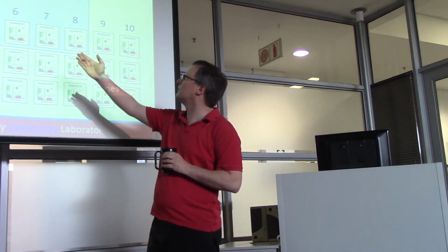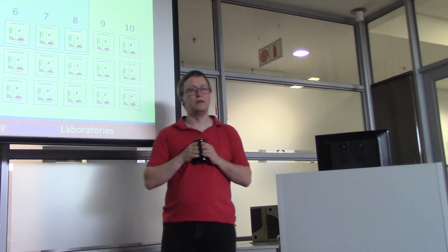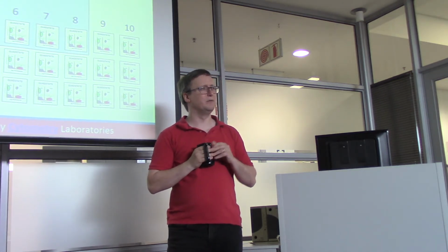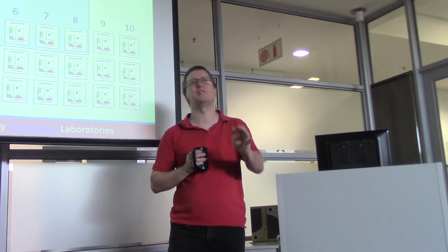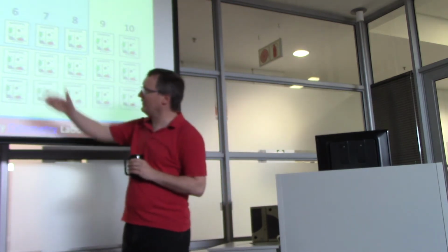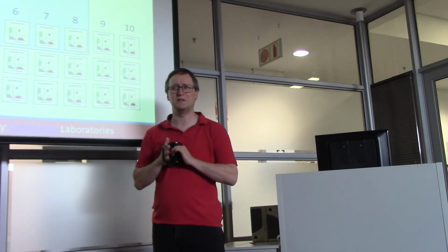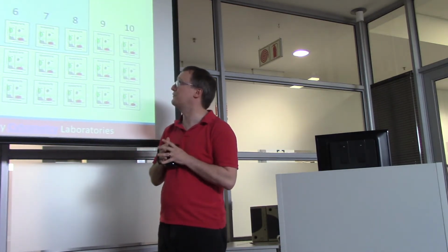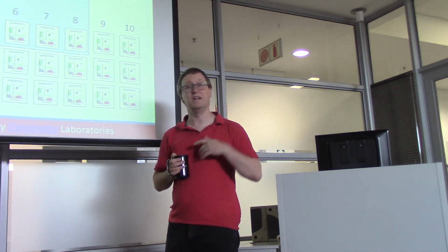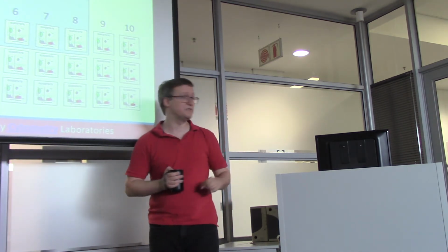Now, as we measure more and more colors, things get harder and harder for us to interpret a particular gating strategy. It's harder and harder for us to apply these rules, even if you have one canonical set of rules you want to use for gating across a very large number of samples. So we think of humans as being particularly good as long as we're dealing with 3 colors or less. But once you start getting to 4 and 5 colors, your ability to do this as a researcher is going to diminish. And you might have irregularities that creep in when you try to apply the same gating strategy to a very large number of samples.